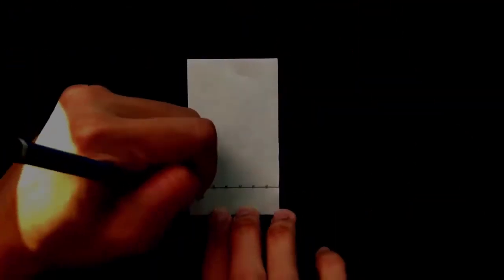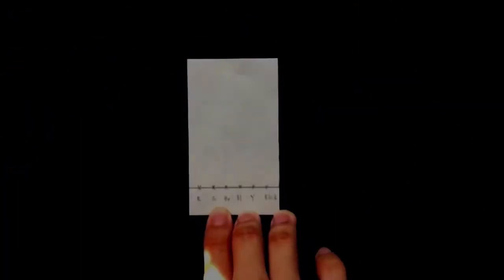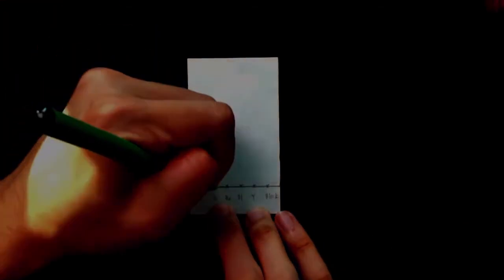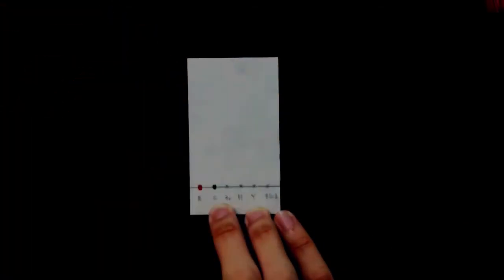Using a filter paper, we first draw a line about 1.5 cm above the baseline of the filter paper using a pencil. Next, we apply small but concentrated markings on our filter paper. This is to ensure that we have enough components so that even when they get diluted as they go up, we have enough. If the sample spots are too large, it will be difficult to distinguish the individual spots on the chromatogram.